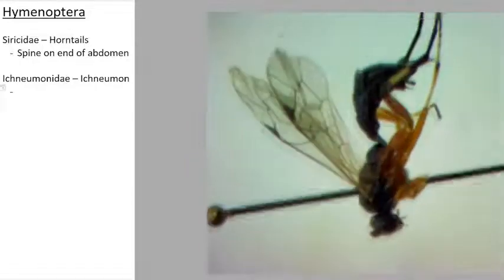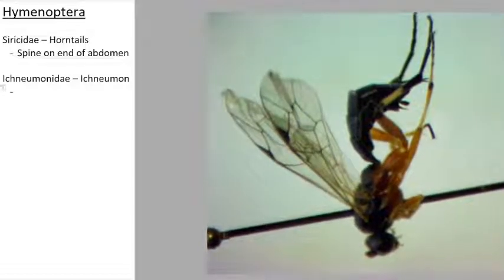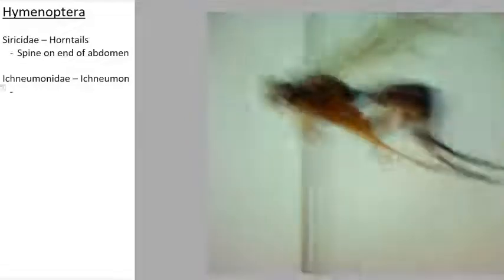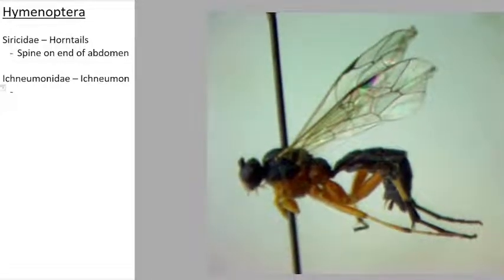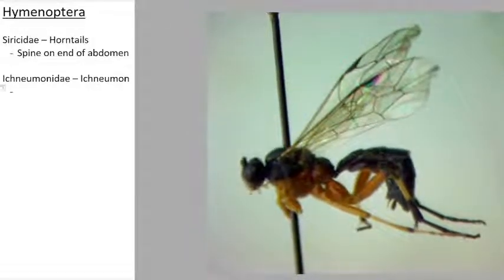So this is going to be our ichneumon wasp. Sorry, he lost his antenna at some point in his life. All right, let's see. Maybe I turn it so that he's facing up. All right, so as we are looking at the ichneumons, we're going to be looking at the wing venation.